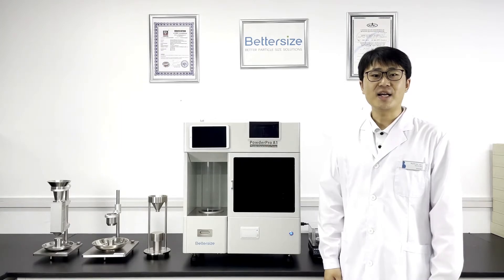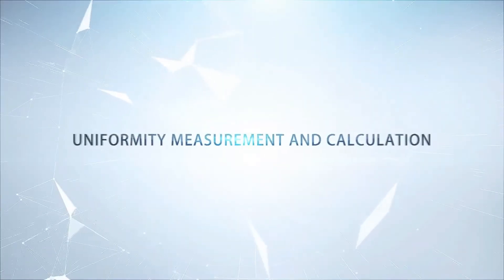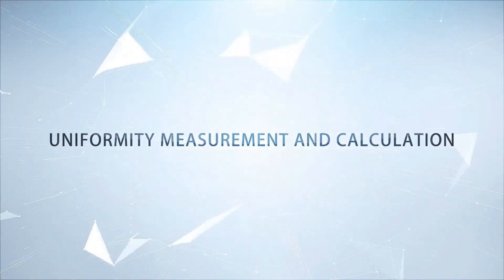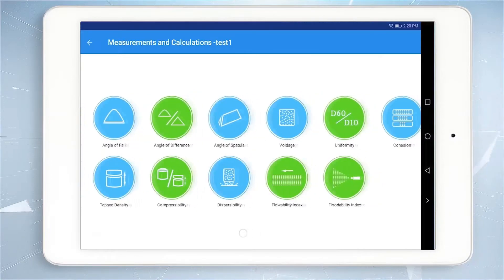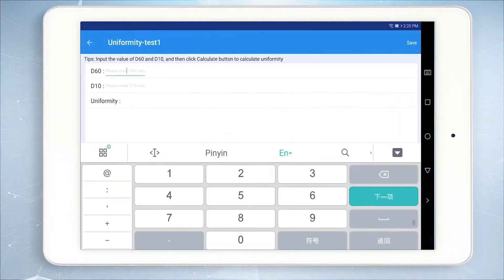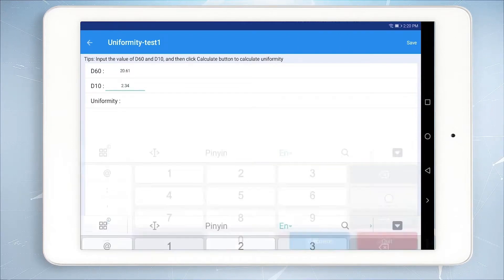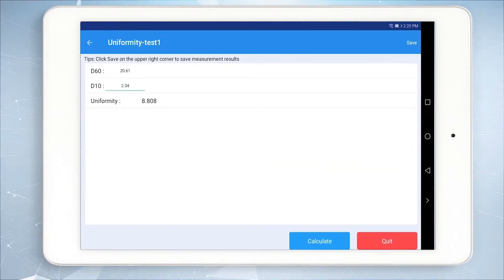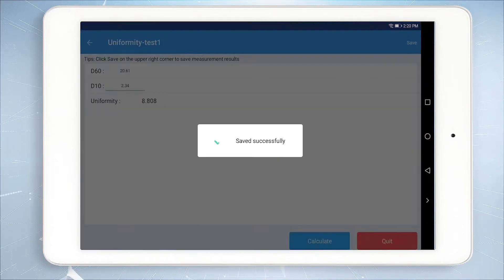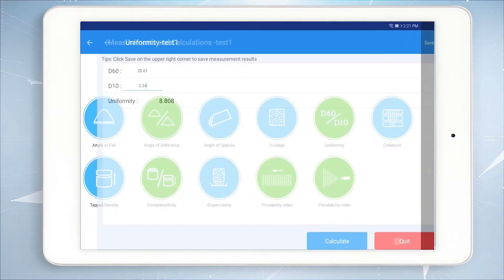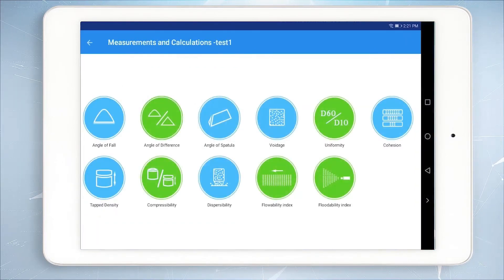Let's start the measurement. Uniformity measurement and calculation: click Uniformity, then enter the values of D60 and D10 measured by the laser particle size analyzer. Click Calculate to get the uniformity, then click Save and Quit to complete the uniformity measurement and calculation.